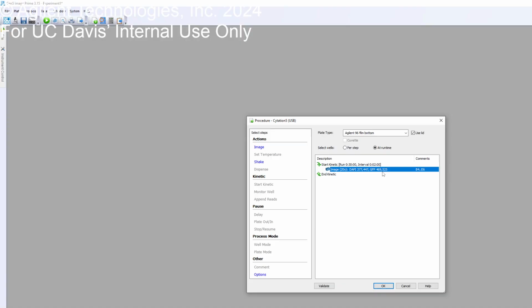That would be fun for the microglia too. Like do the kinetics and put the inflammatory stimulus and then see how they evolve over time, if you want to do depolarization stuff. Check that out. So that's a great option, and the video I showed you guys is going to talk a little bit more about the kinetics. I just deleted that for now.